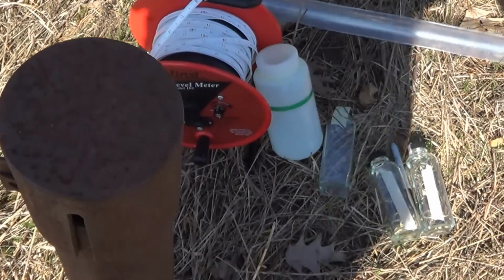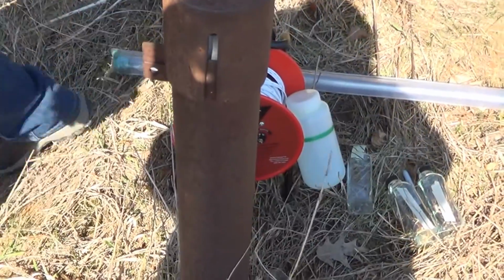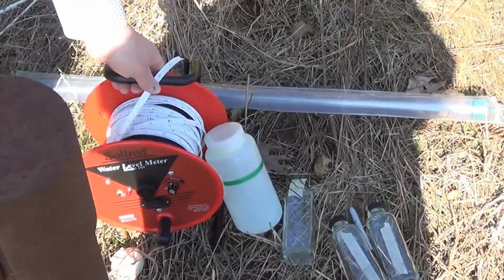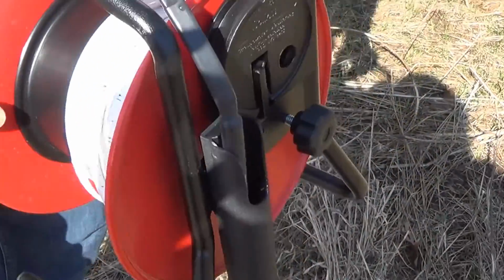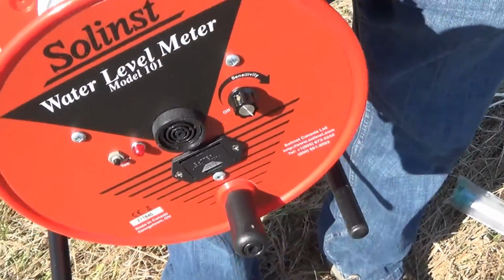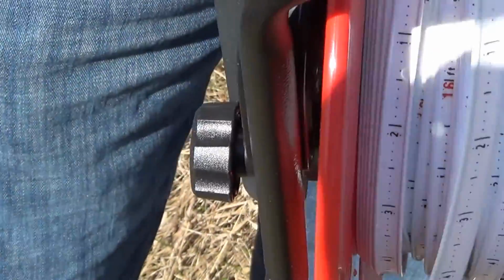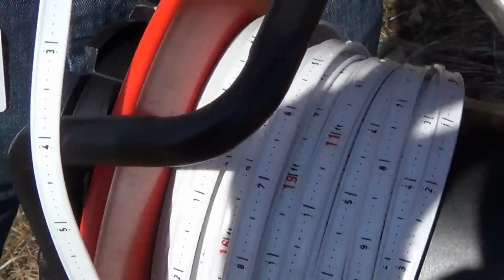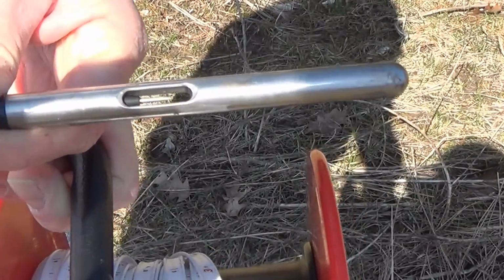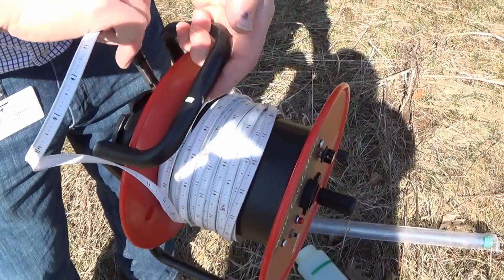So let me demonstrate our level instrument. So here's our level measuring instrument. It's got some batteries. You can see on this side we have some batteries. We also have an electrical probe. So once this part of the probe, right in the middle there, reaches the water, you'll hear the beep. So it's as simple as measuring down on this tape.